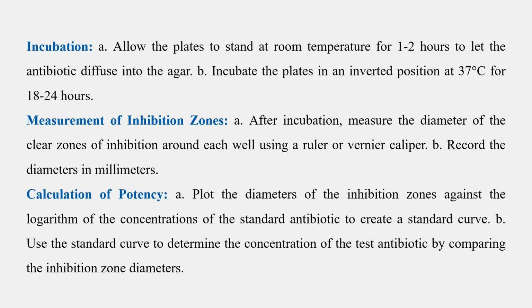Next is incubation. A. Allow the plates to stand at room temperature for 1 to 2 hours to let the antibiotic diffuse into the agar. B. Incubate the plates in an inverted position at 37 degrees Celsius for 18 to 24 hours.